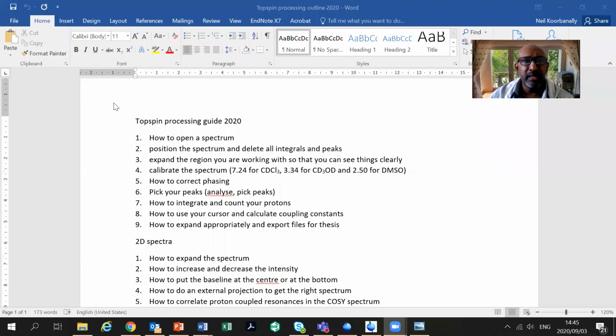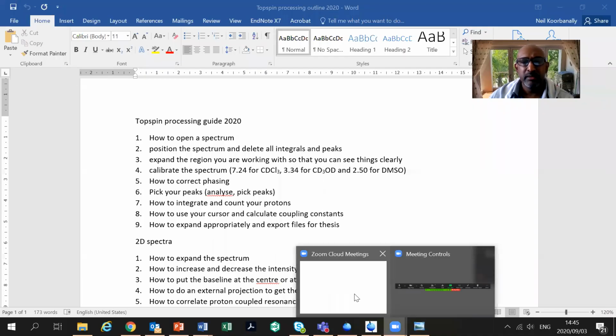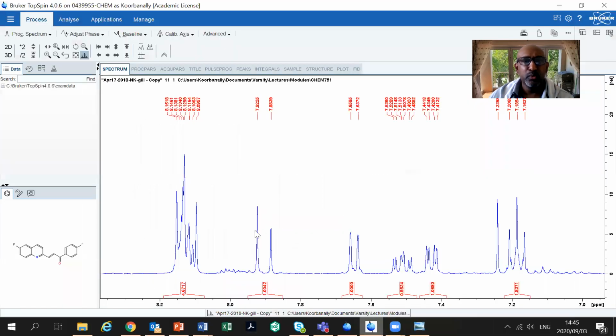Right, so generally what I said initially is that you would have run the sample on your spectrometer and you would have got a data set. And once a data set gets created, you can either go with your flash drive and collect the data, or, since some people don't like students putting flash drives into their instruments or computers, they put the data on a shared folder where you can go remotely and get the files.